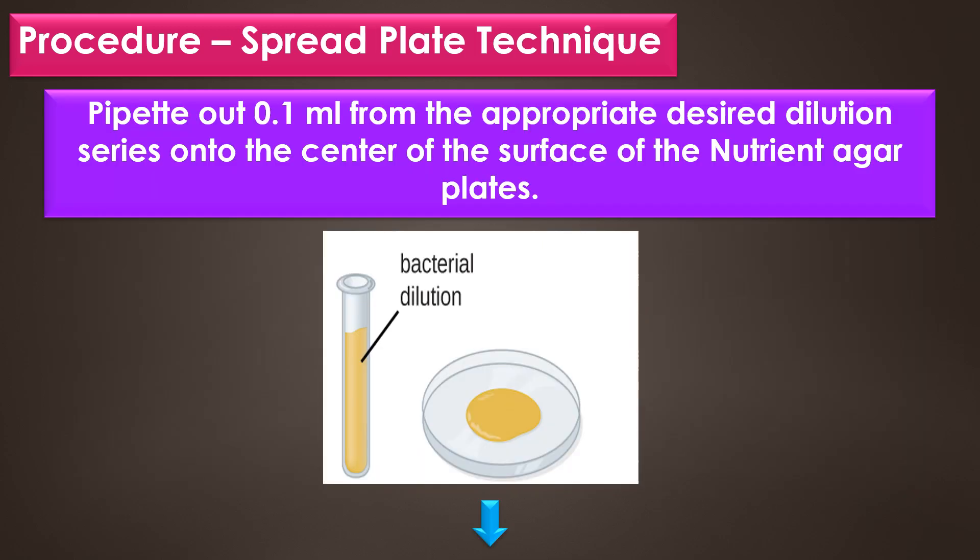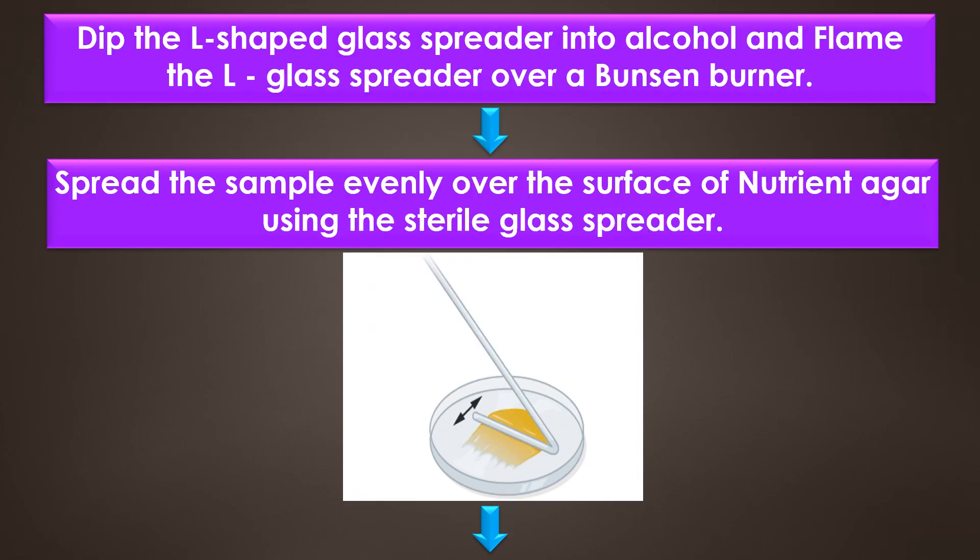The next procedure is the spread plate technique. First, pipette out 0.1 ml from the appropriate desired dilution series onto the center of the surface of the nutrient agar plates.